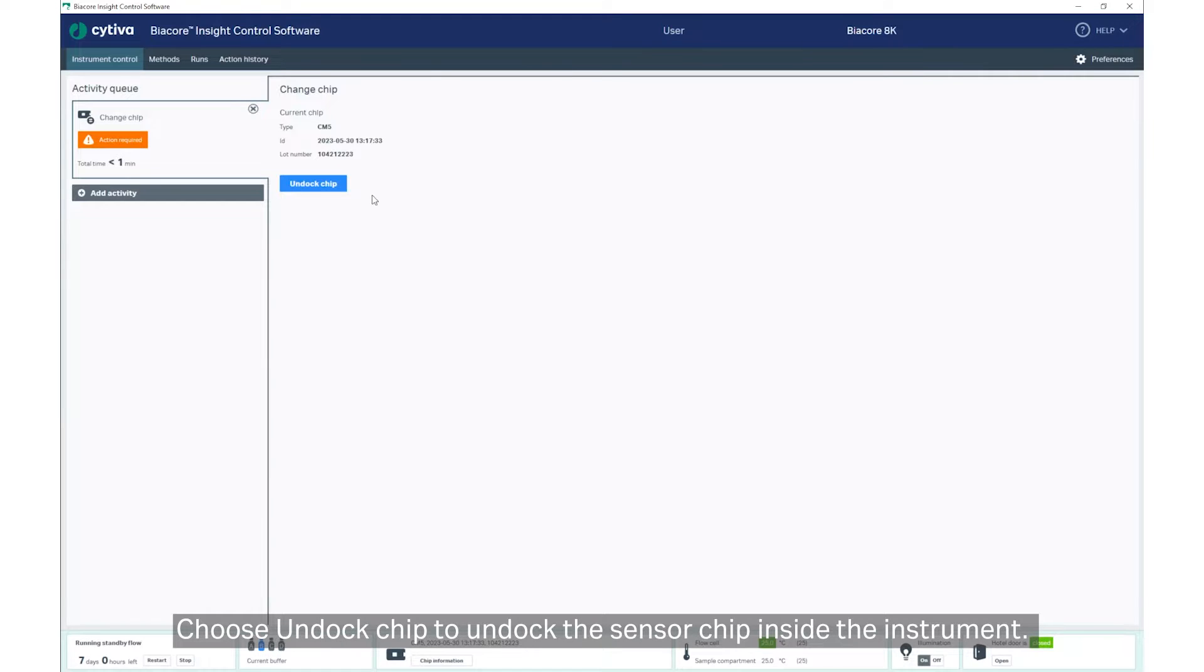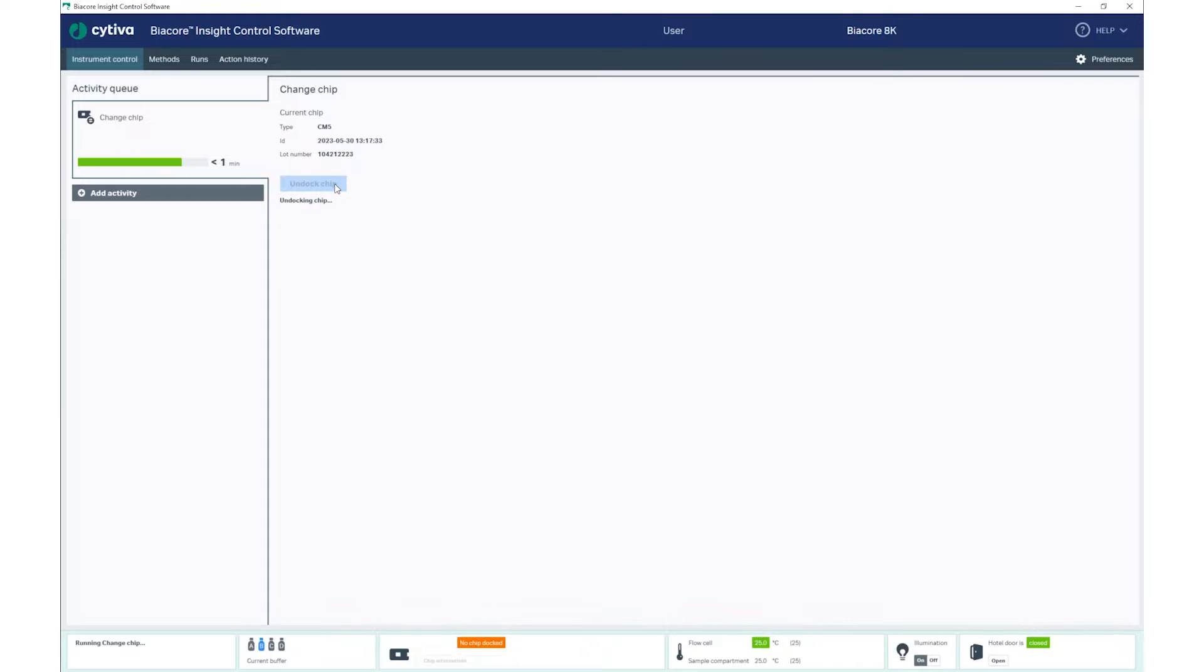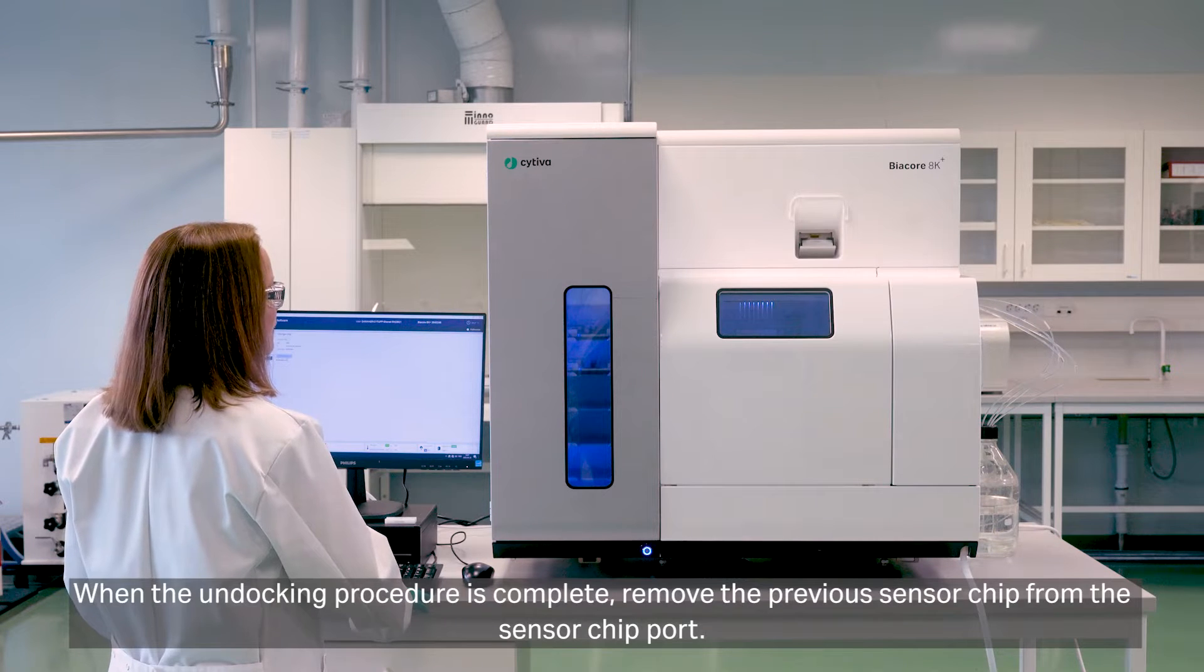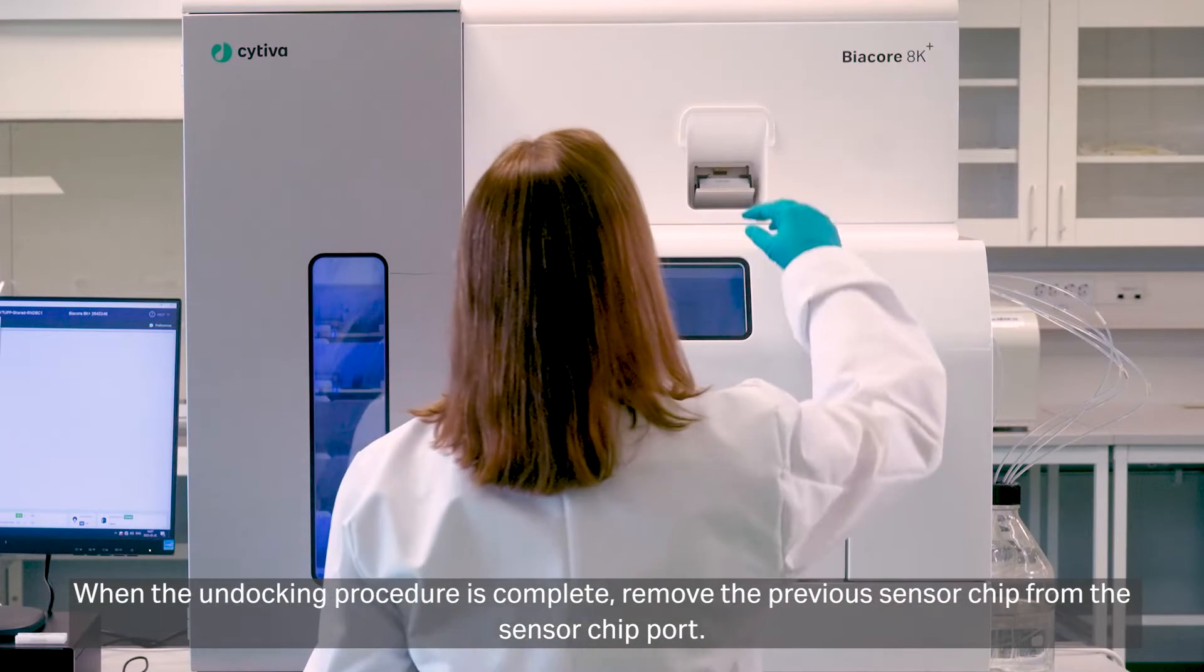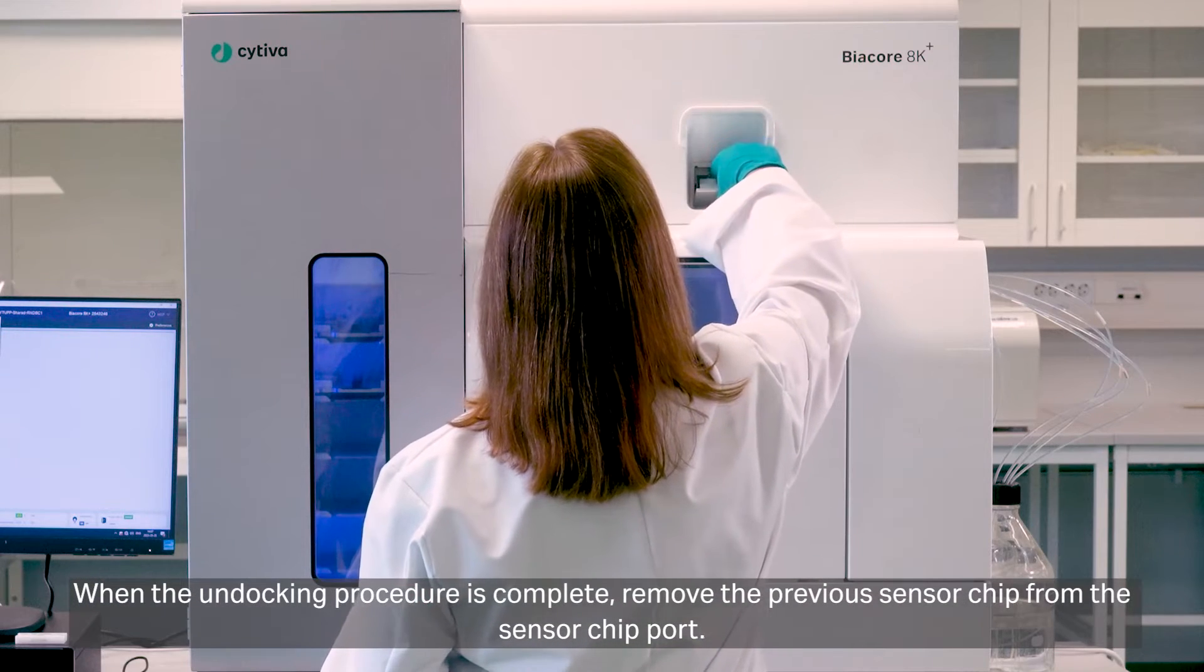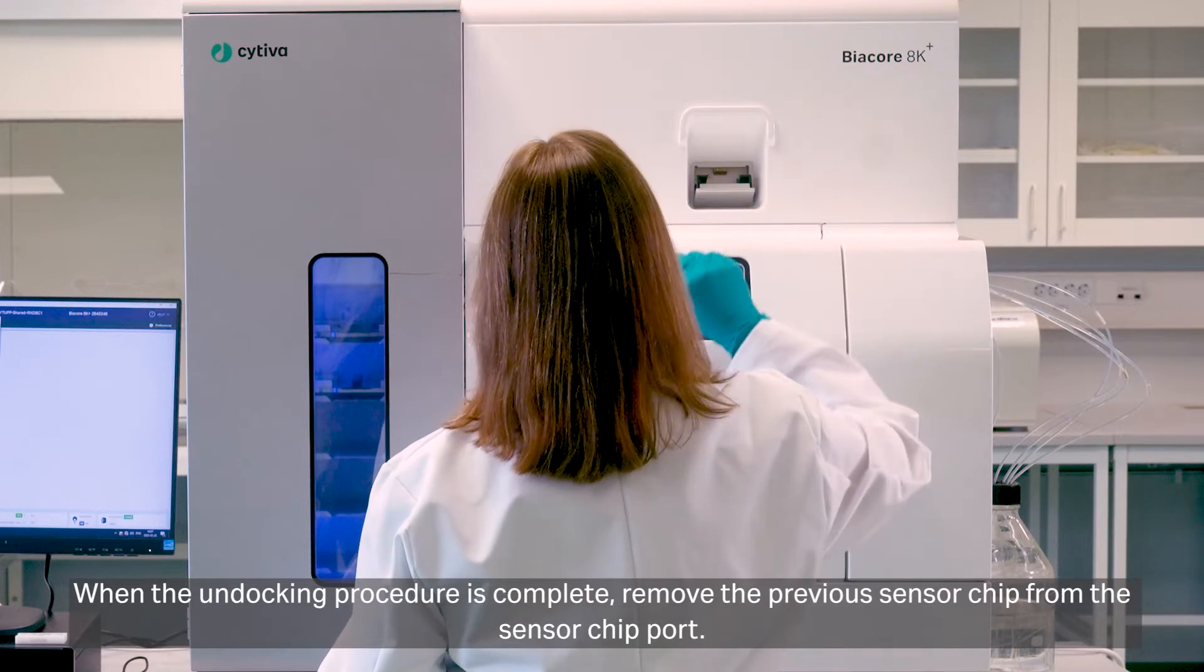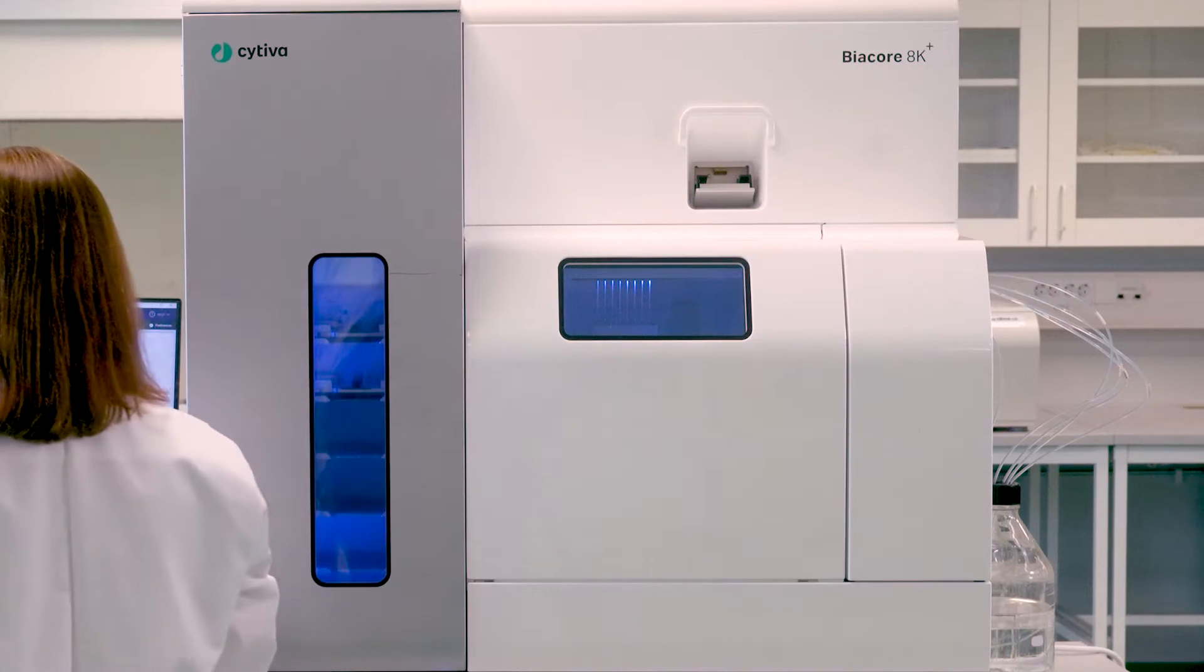Choose Undock Chip to undock the sensor chip inside the instrument. When the undocking procedure is complete, remove the previous sensor chip from the sensor chip port.